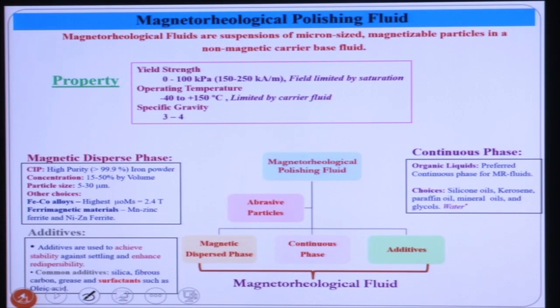So now we are going to start the rheological characterization of magnetorheological polishing fluid. So what are the components of MR polishing fluid? It consists of CIP particles, abrasive particles and base media. First, we prepare the base media. The base media consists of paraffin oil and EP3 grease.